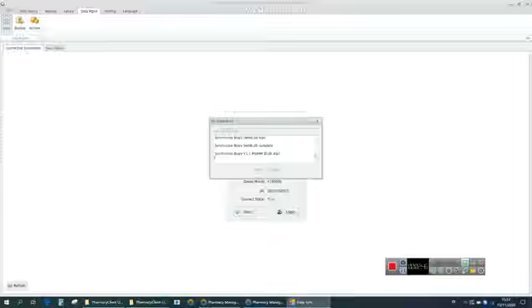Now synchronize complete, and we can close the synchronized windows and select the PDF report. You can just see the scan test 1 and the records we have just generated, and you can open it here.